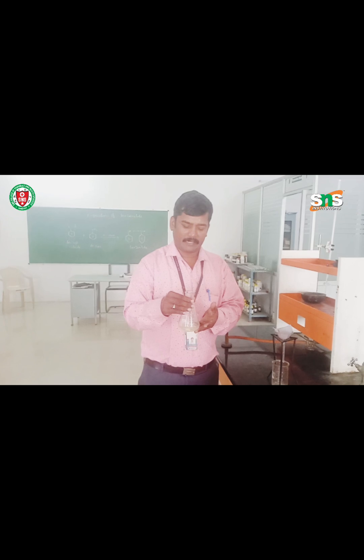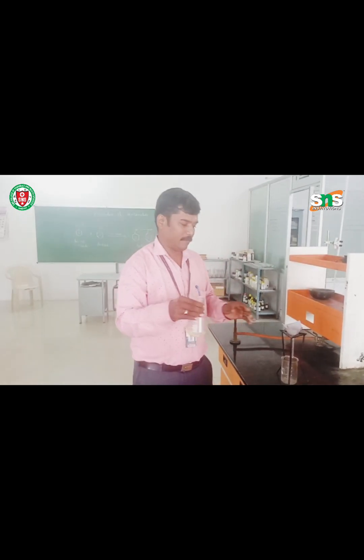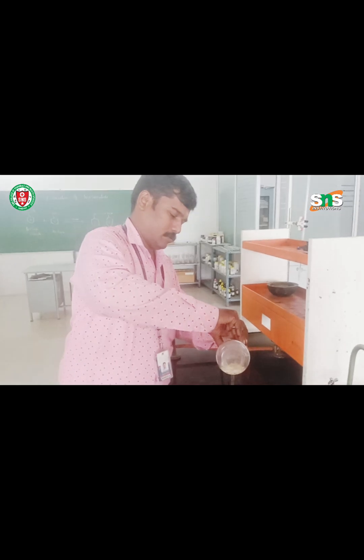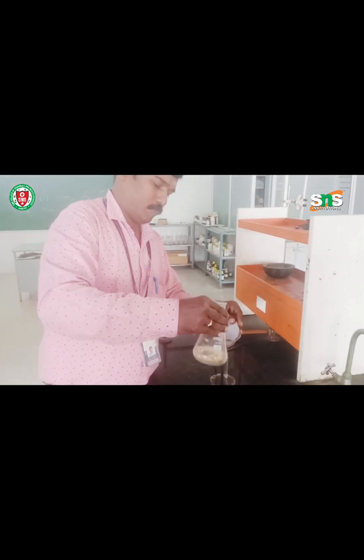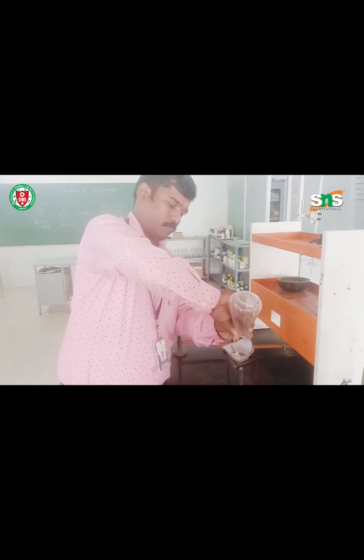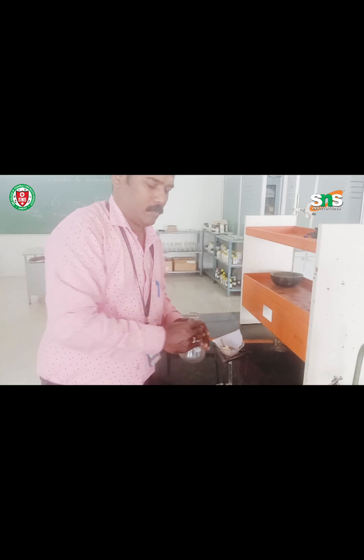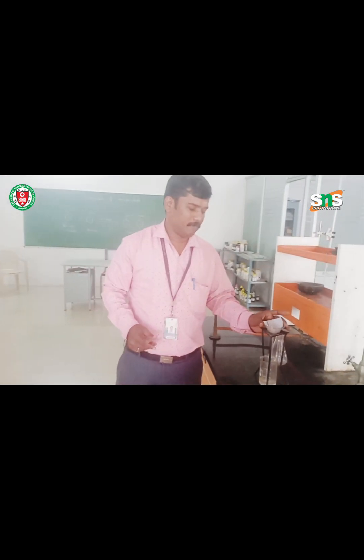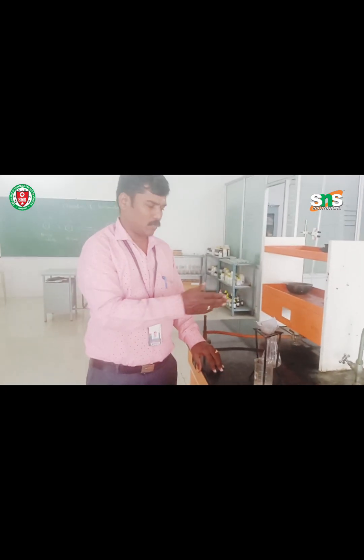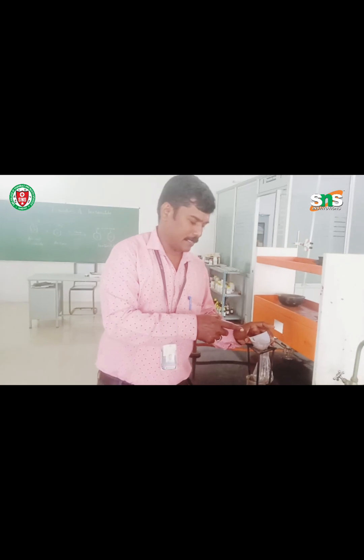The next step: after the formation of benzanilide, you have to filter this. I will now slowly do the filtration. You will get the product benzanilide — you have to wait for the complete filtration. After filtration, you have to dry the product. I hope you could understand this preparation. After completing this filtration, you have to keep it in a hot air oven for drying. We have successfully completed the filtration.